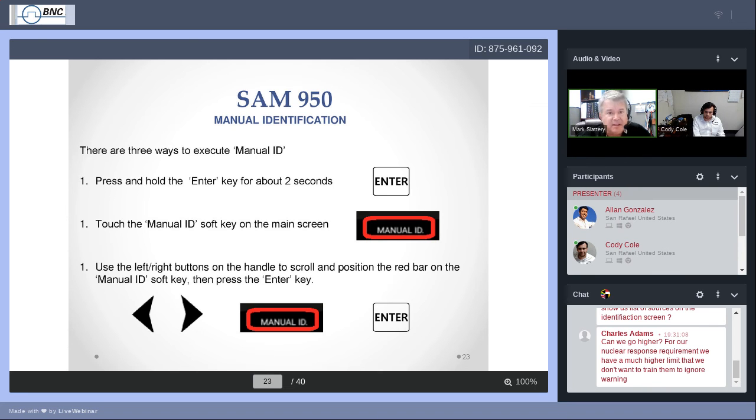What else we got here? We've got the alarm. And this is also when you get up to something, maybe at like 10,000 counts, and the alarm is really screaming. You don't have to back up very far to get that energy down from, say, 10,000 to 2,000. And this is something that's referred to as the inverse square law. This is another great thing that Isaac Newton shared with the world. And what it describes is the fact that the energy from a source decreases by the square of the distance.